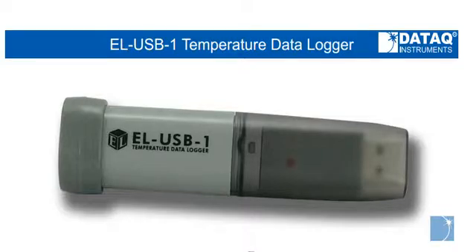The ELUSB-1 is a stand-alone data logger that allows you to acquire ambient air temperature from minus 31 to 176 degrees Fahrenheit.